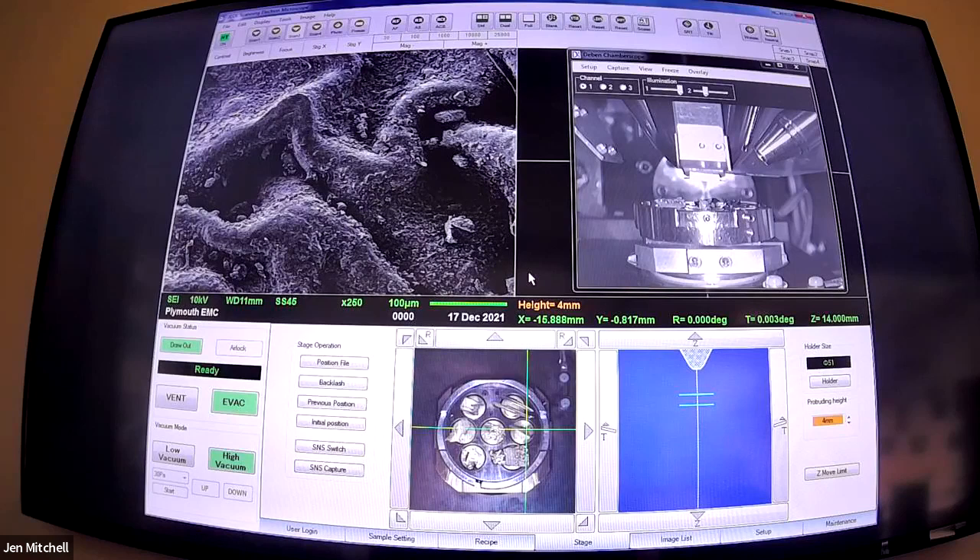An extra fun feature about this microscope is it has options to do auto contrast brightness - it will work out the settings it thinks are best. It's also got an auto focus button and an auto stigmation button, and these actually work really well. The 7001 has auto contrast and brightness but it puts it on the worst setting - it's either too bright or too dark. Sometimes the setup just doesn't work on auto things. But it's exciting when it does work.